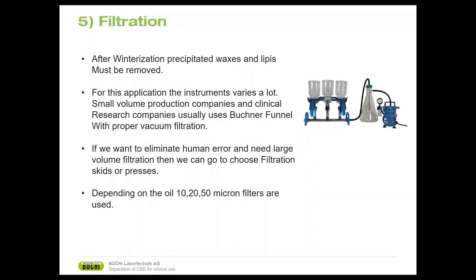Once the winterization is finished, filtration is done to remove the precipitated waxes. For this application, the instruments vary a lot. Small volume production companies and clinical research companies usually use a Büchner funnel with proper vacuum filtration. If we want to eliminate human error and need to go to larger volume, then we can choose filtration skids or filtration presses. Depending on the oil, 10, 20, 50 micron filters can be used to remove the waxes from the oil.